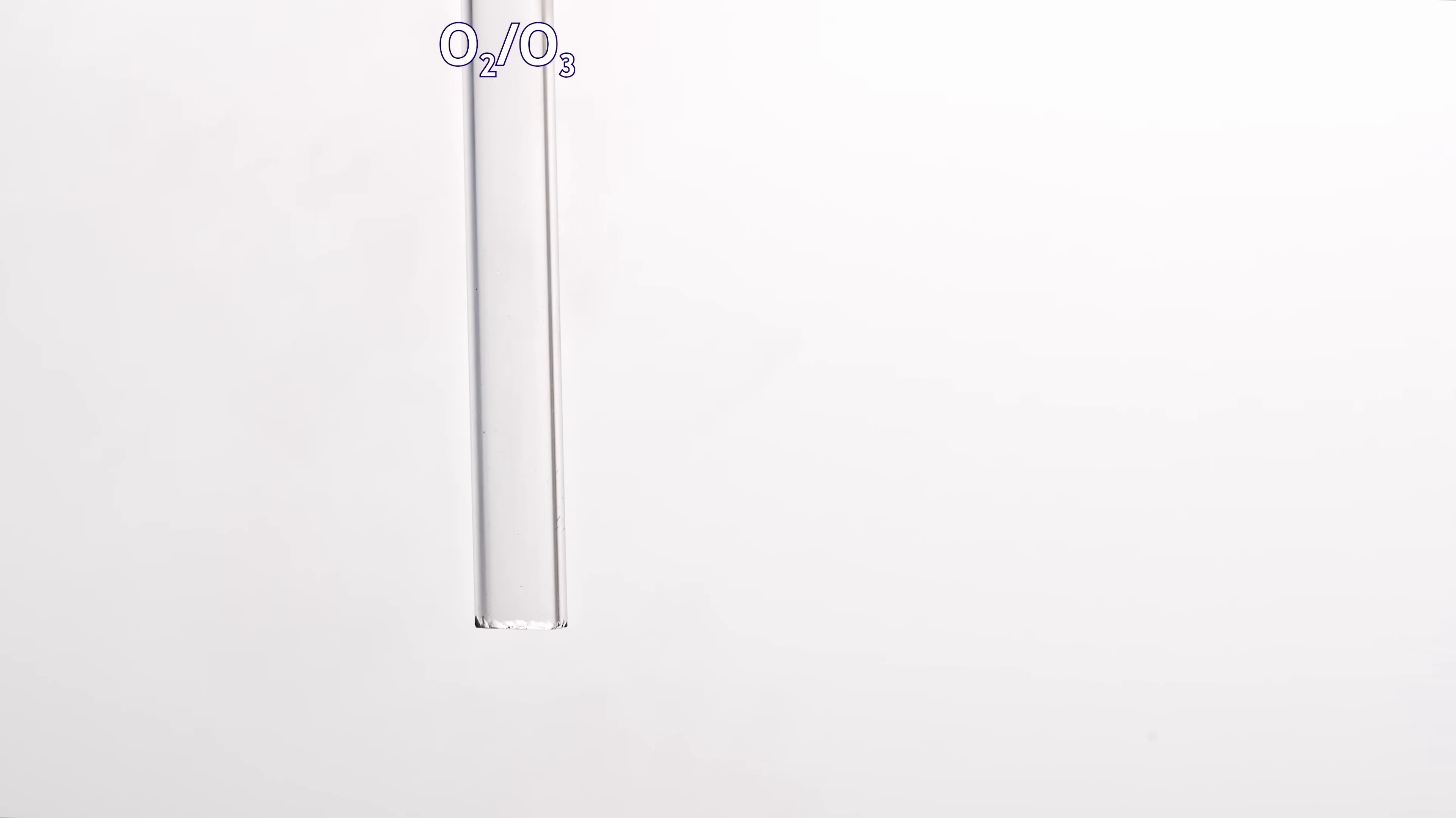If I cool a glass tube through which I pass ozonated oxygen, violet droplets of liquid ozone will start to form.